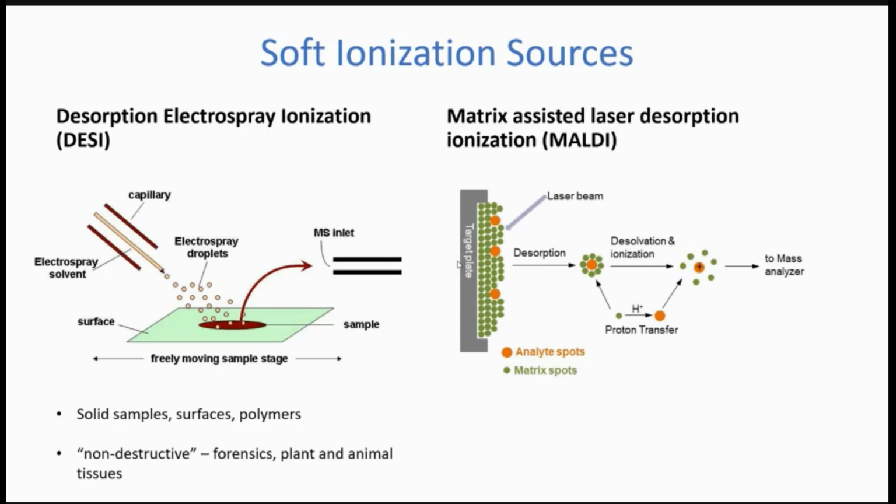Similar to DESI and likely more popular is matrix-assisted laser desorption ionization, or MALDI. And here you embed your sample in a special matrix.